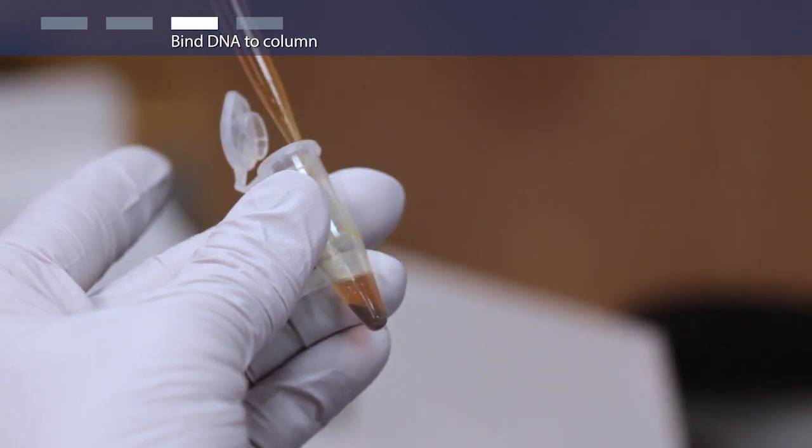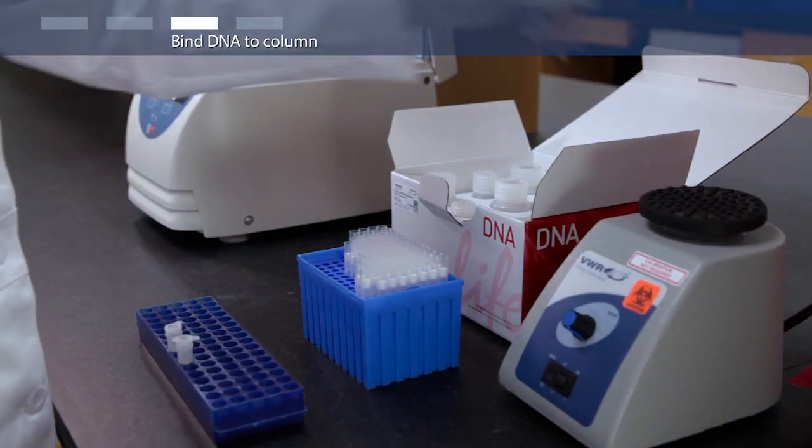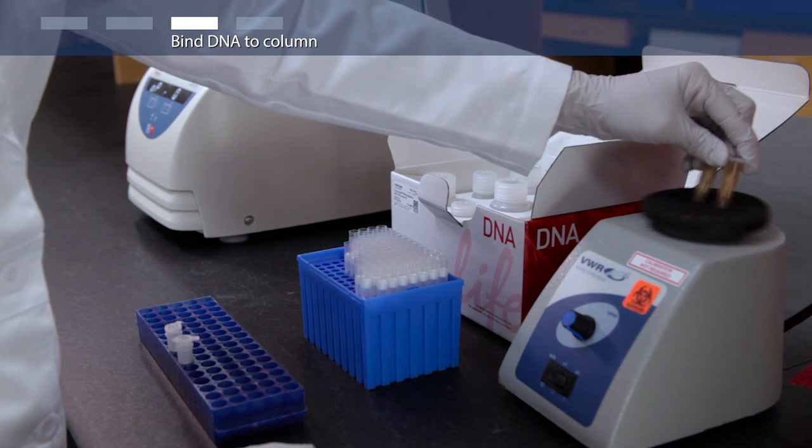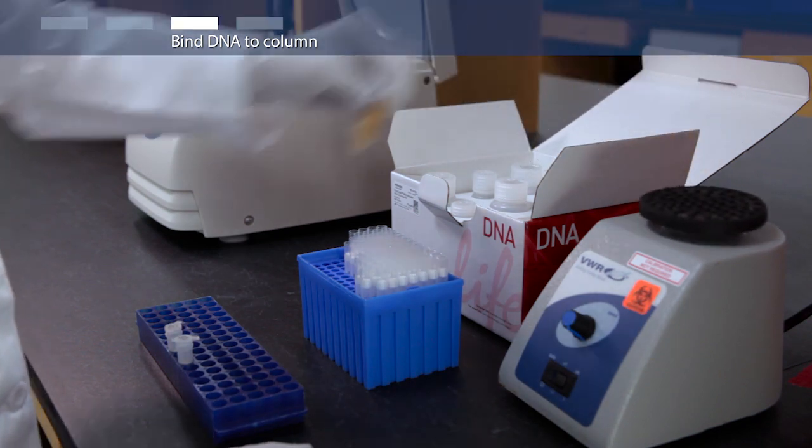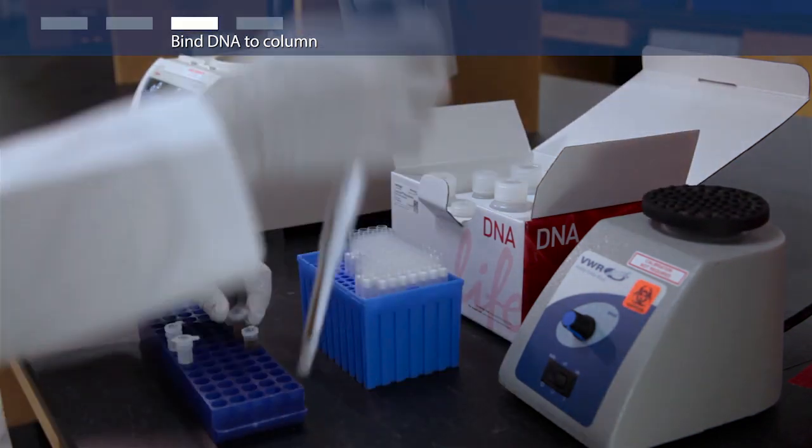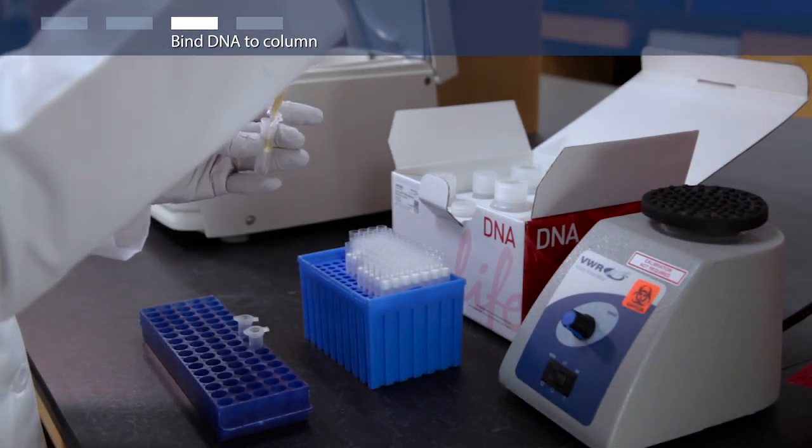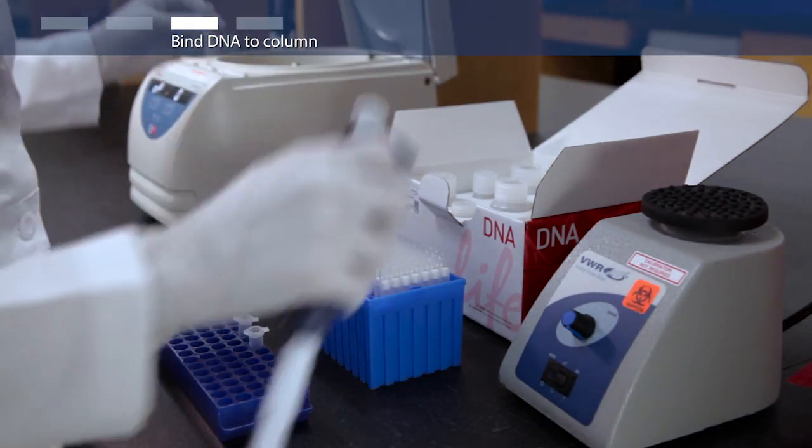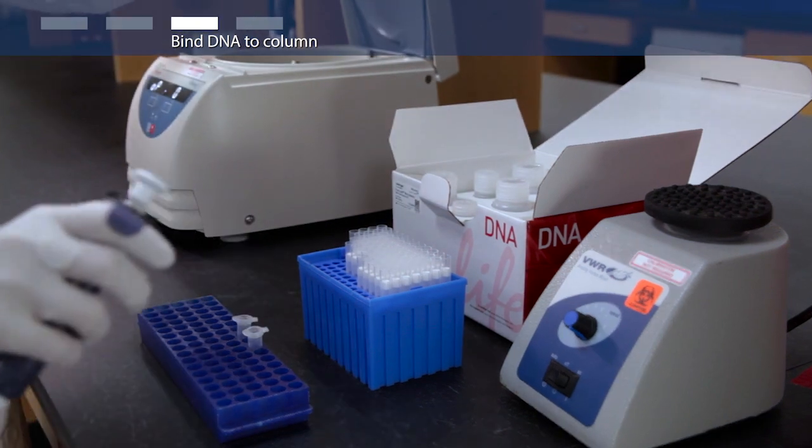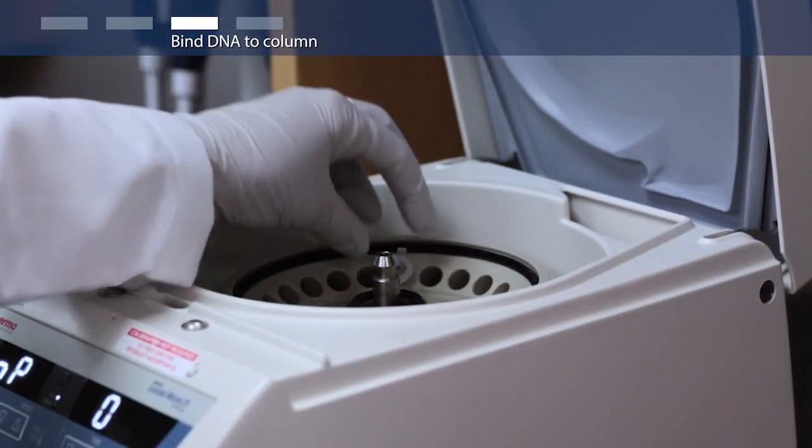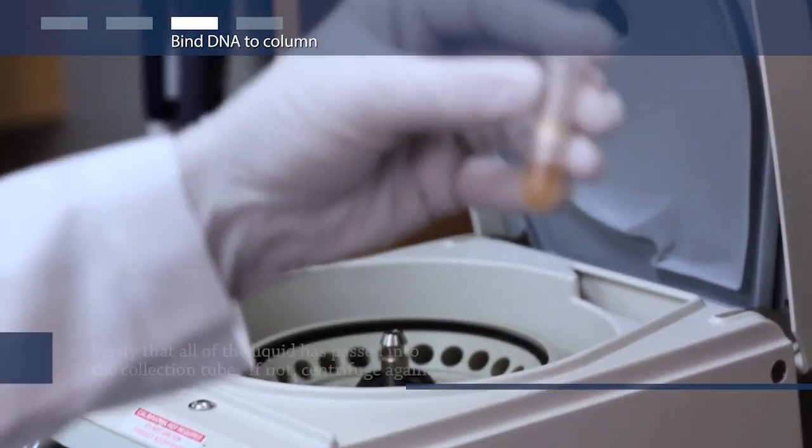Now, you'll bind DNA to the column. First, add 900 microliters of binding buffer and vortex briefly. Load 700 microliters of the sample mixture into a spin column and tube assembly and centrifuge at 14,000 G. Discard the flow through and repeat.